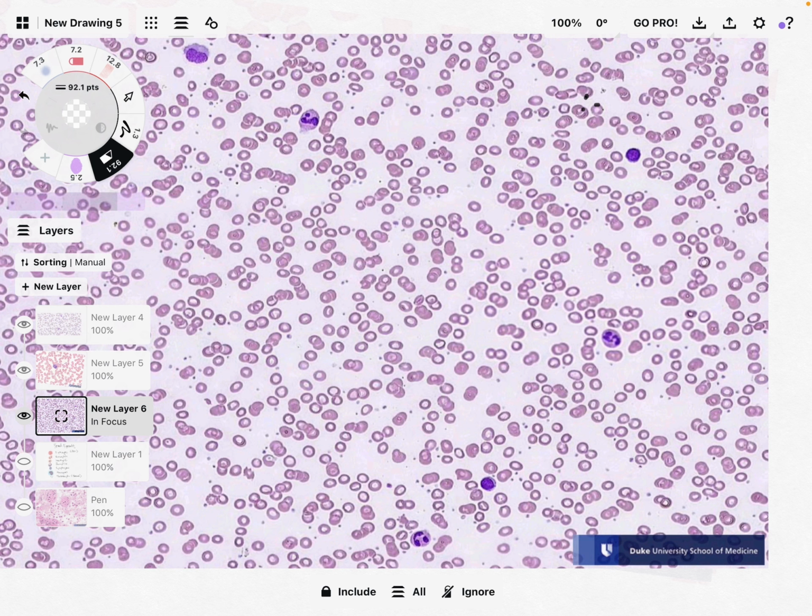So I'm using Duke University School of Medicine's slides from their website. I recommend, especially as you start to practice, as you should, to help you prepare for your histology exam, histology lab exam, or maybe the histology component of your lab practical for A&P. These are great websites to go look at these different things and really practice and get a good feel of what you're looking for. Okay? All right, so that's my spiel for Duke University.